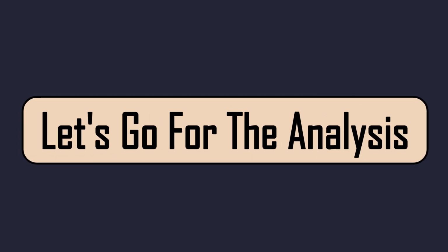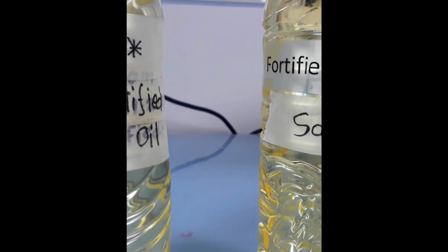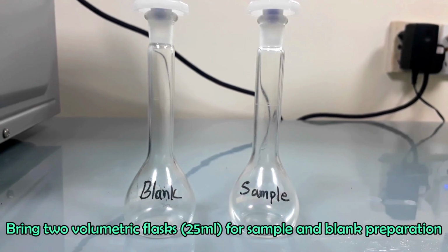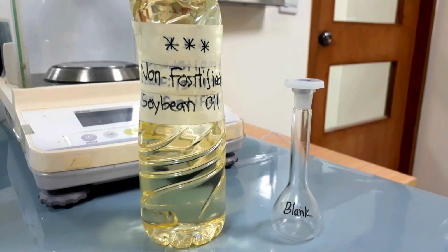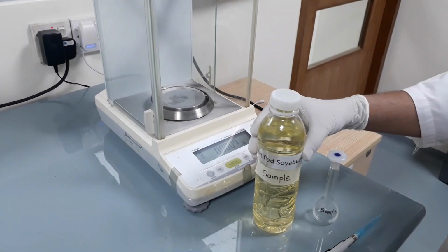Let's start the analysis. At first, we will prepare sample and sample blank together. Bring oil sample along with unfortified oil. Bring two volumetric flasks of 25 ml. We will prepare our oil sample in one flask and at the same time, we will prepare sample blank in another flask using the unfortified oil.